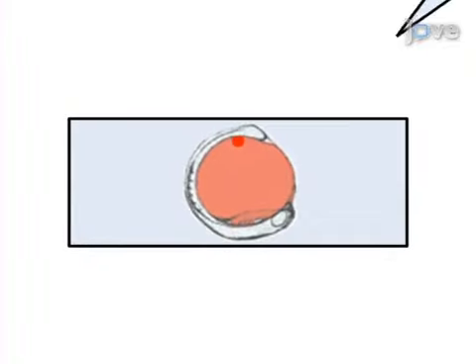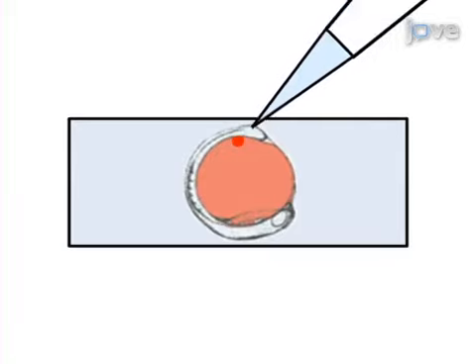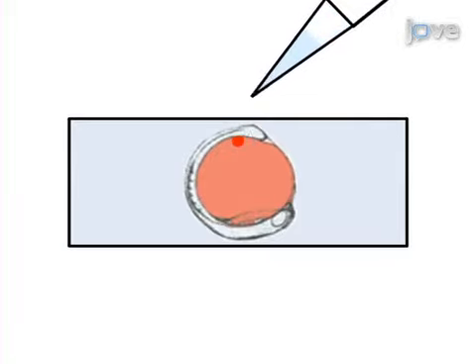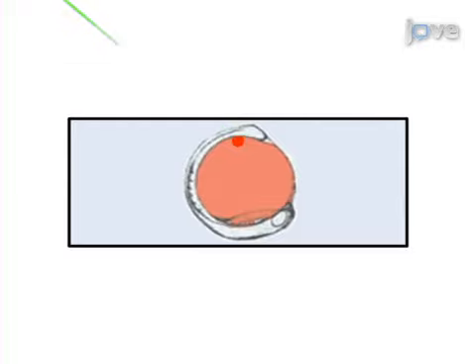Then, the embryos are mounted in depression slides, and fluorescent beads are injected into the fluid-filled vesicle lumen of the KV.